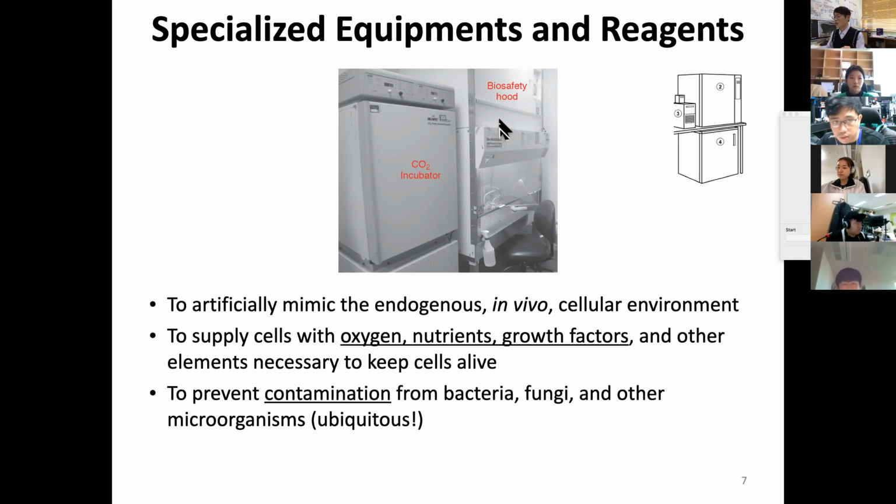So the reason how we can do it is I said laminar hood, which means the flow is laminar, making a kind of curtain with a laminar flow. Why not turbulent? Because turbulent flow mixes things up so that it's easier to contaminate, while laminar flow makes a curtain with the airflow to block the outside air from getting in, okay?